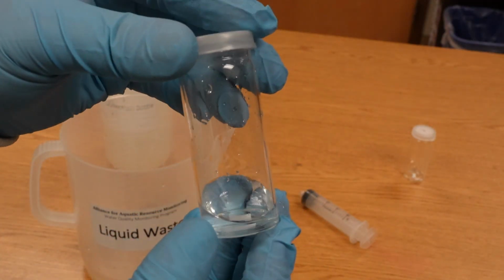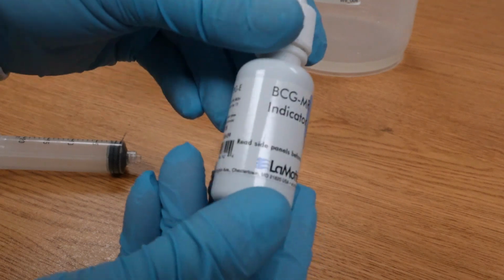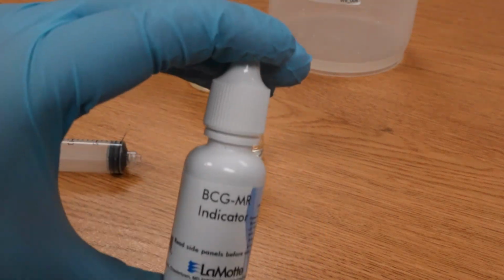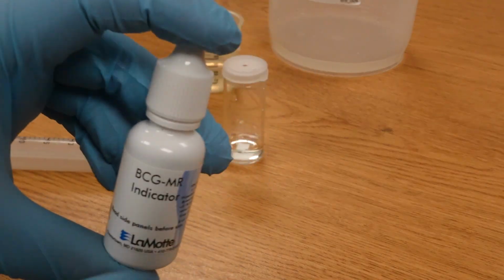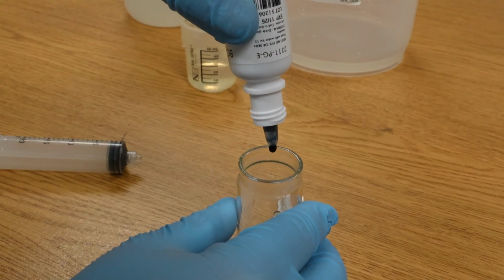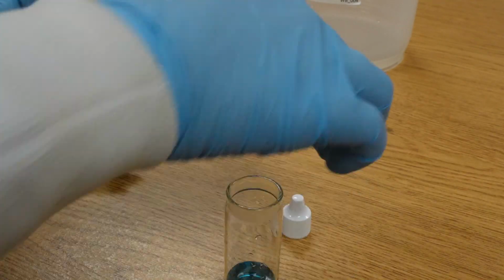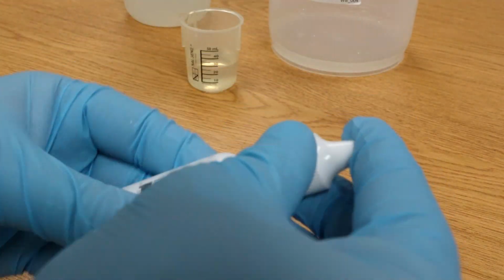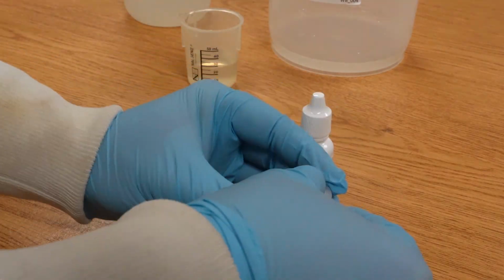Depending on the availability of the BCG-MR indicator, it will either be in tablet or liquid form. If it's in liquid form, invert the dropper bottle 3 times, then slowly add 4 drops of the indicator solution to the titration vial. Make sure you hold the solution bottle vertically when dispensing the solution. If using the tablet form, add 1 indicator tablet into the vial.